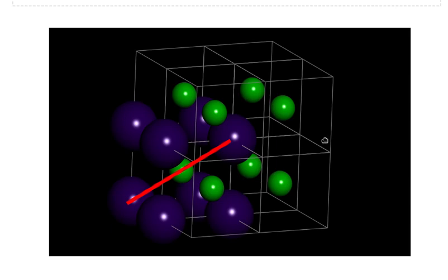You will by now know the ionic radius of chlorine, and so you will be able to use that in the next stage of calculation. For the next stage, once you know the A for cesium chloride, A is just the length of that cube that you've got there.